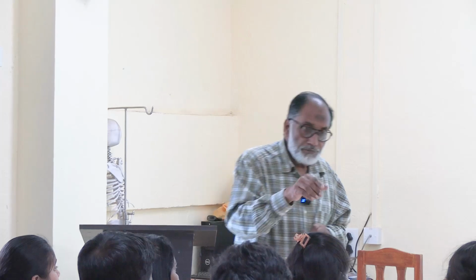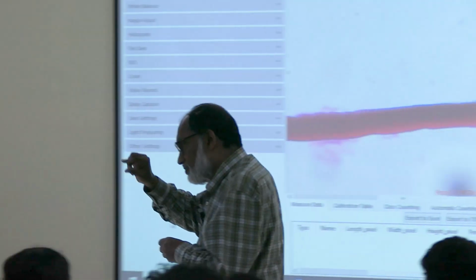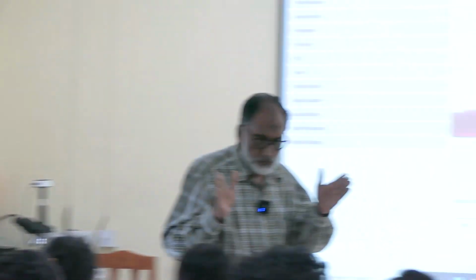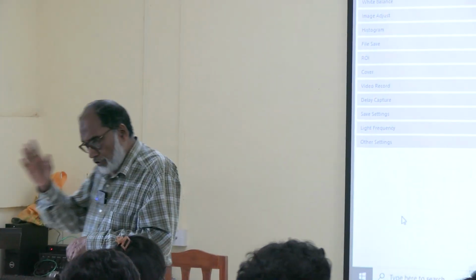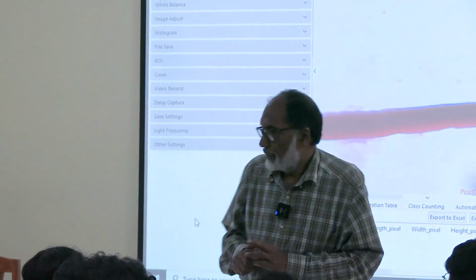Now come to cardiac muscle. The cardiac muscle has a single nucleus. The cell shape is cylindrical, short cylindrical. The nucleus is central in position, oval in shape. Here also you will get striations, but they are not so prominent as in skeletal muscle, right?